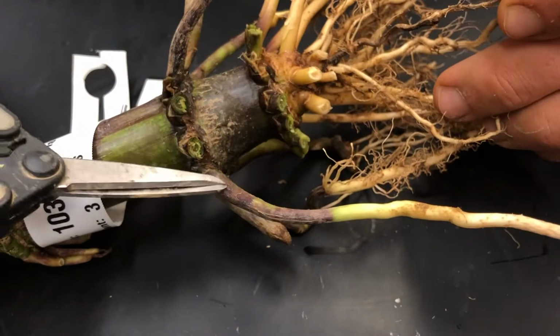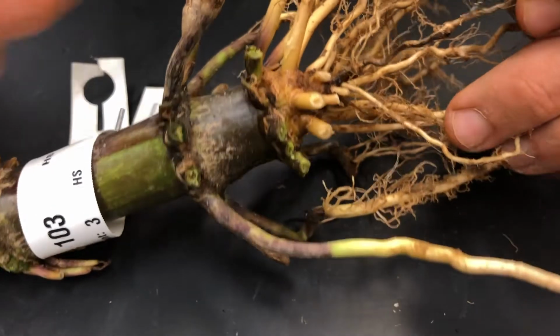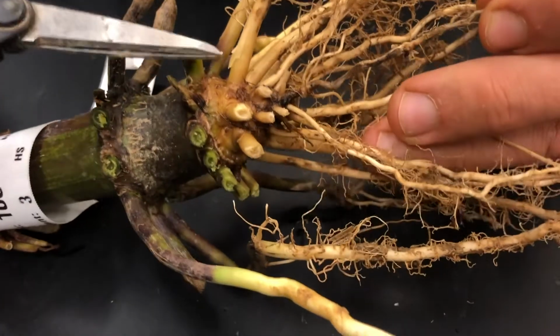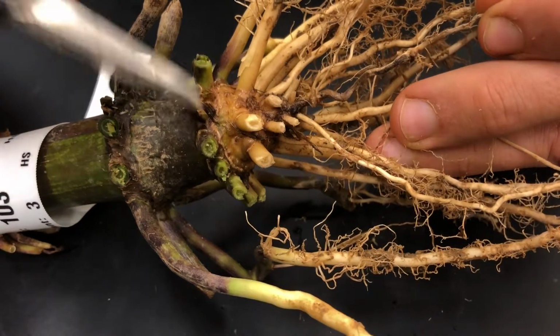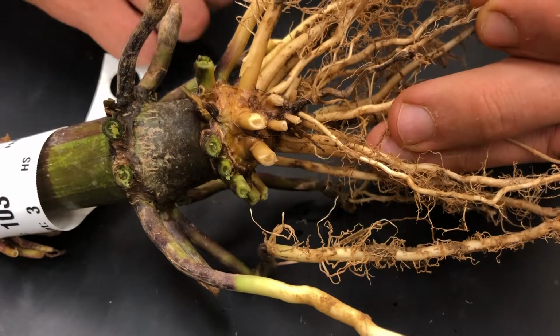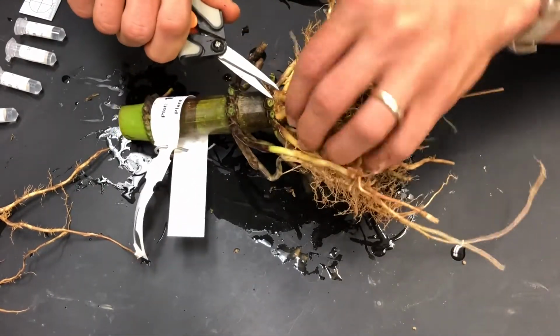These pigmented roots, which are emerging above the soil surface, are called brace roots. Because these nodal roots are developing over time while stresses like drought may be becoming more severe through plant growth, our group is interested in collecting anatomy samples from across these different whorls to look at how anatomy may change from whorl to whorl. A sharp set of pruners are an ideal tool for removing roots from the crown.